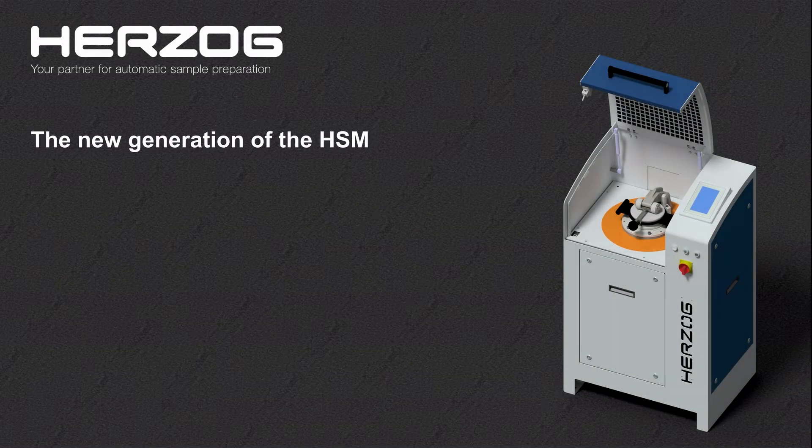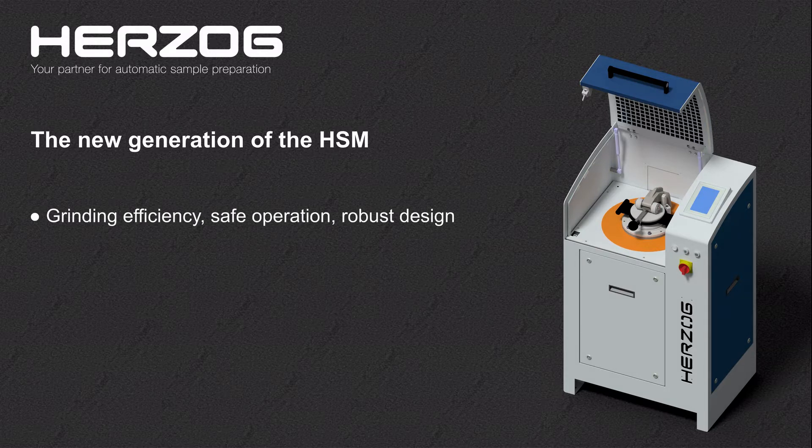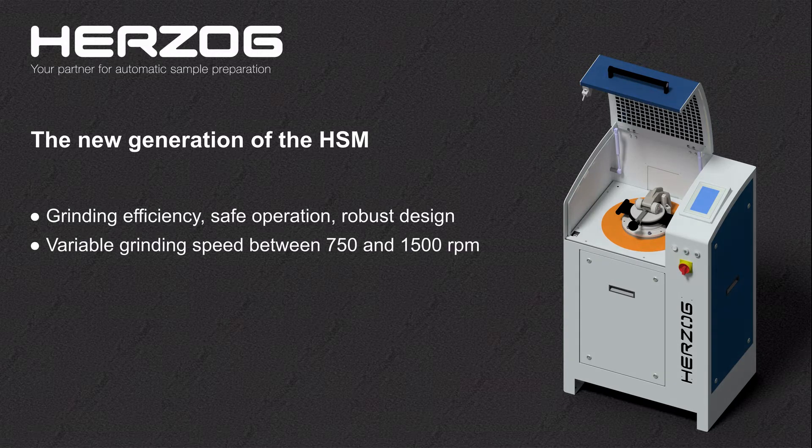Herzog introduces the new generation of the HSM, the manual vibratory disc mill for fine grinding of hard, medium hard and brittle materials. The current model combines well-known grinding efficiency, safe operation and robust design of the HSM with many new and improved features. Even in the basic model, the grinding speed is now infinitely variable in the range between 750 and 1500 RPM.